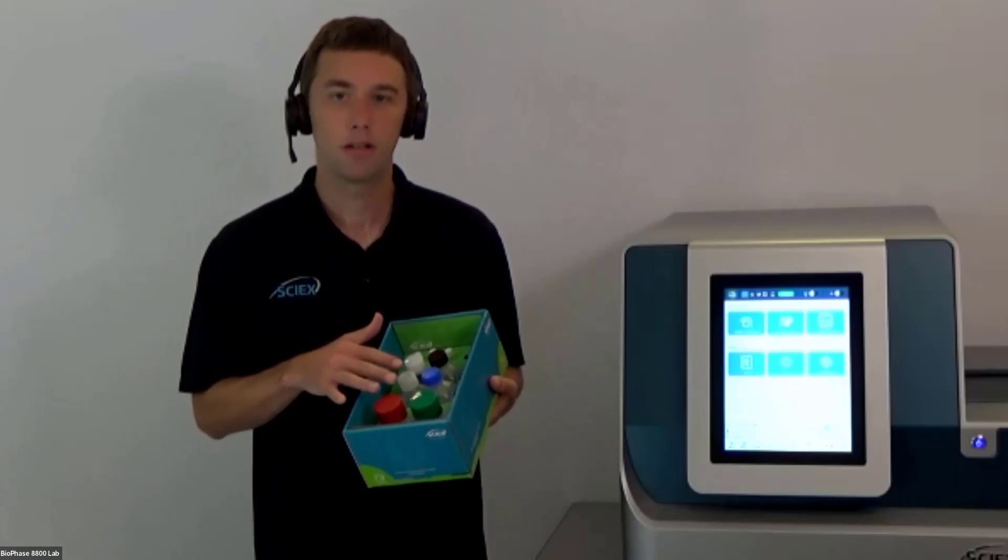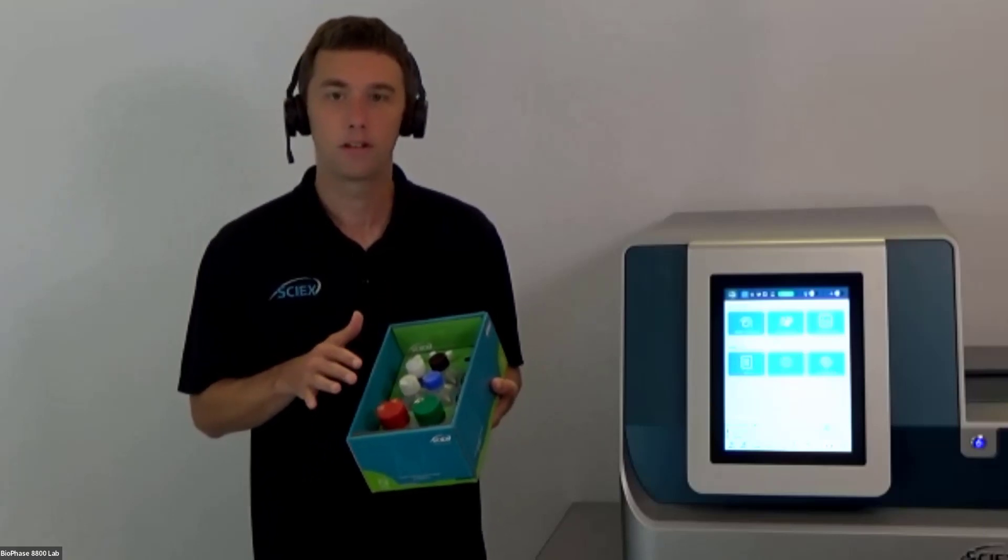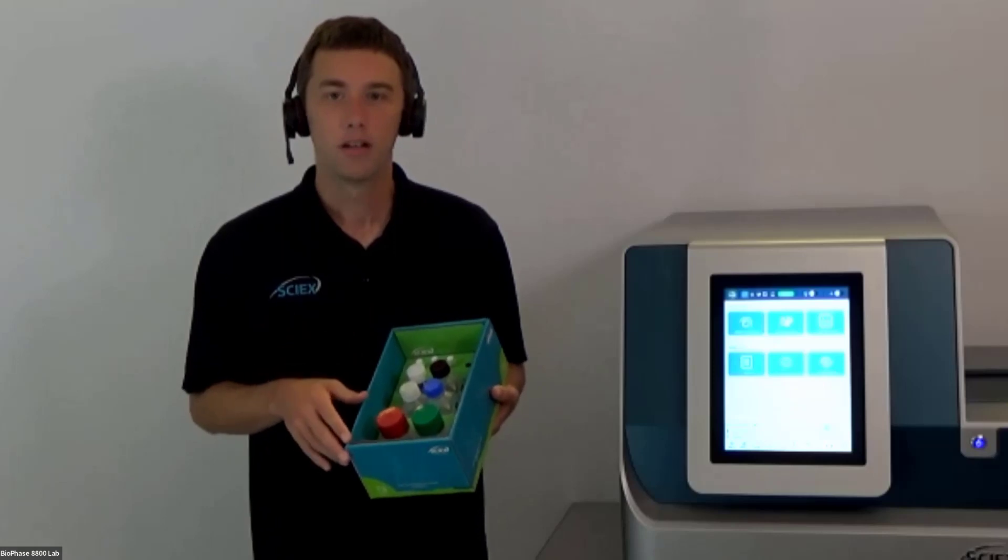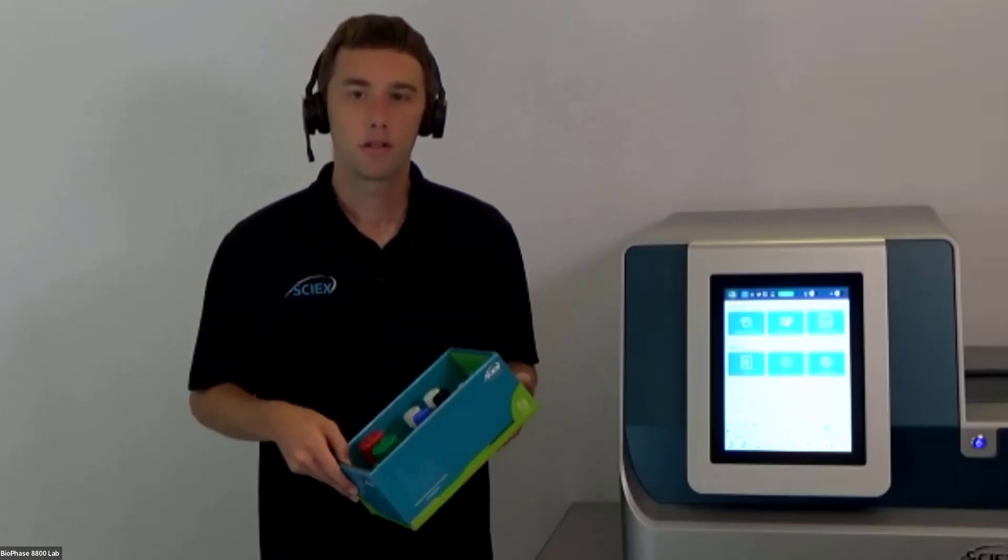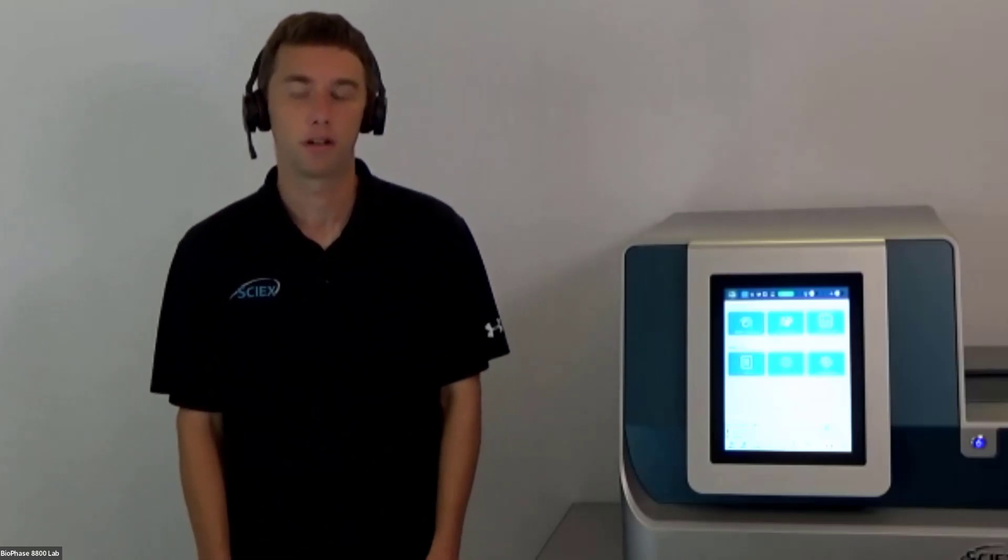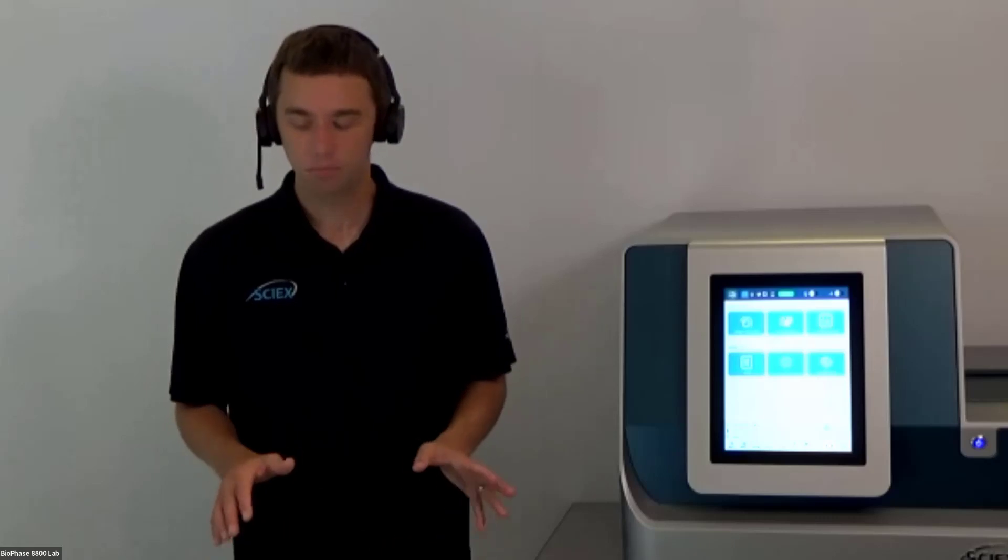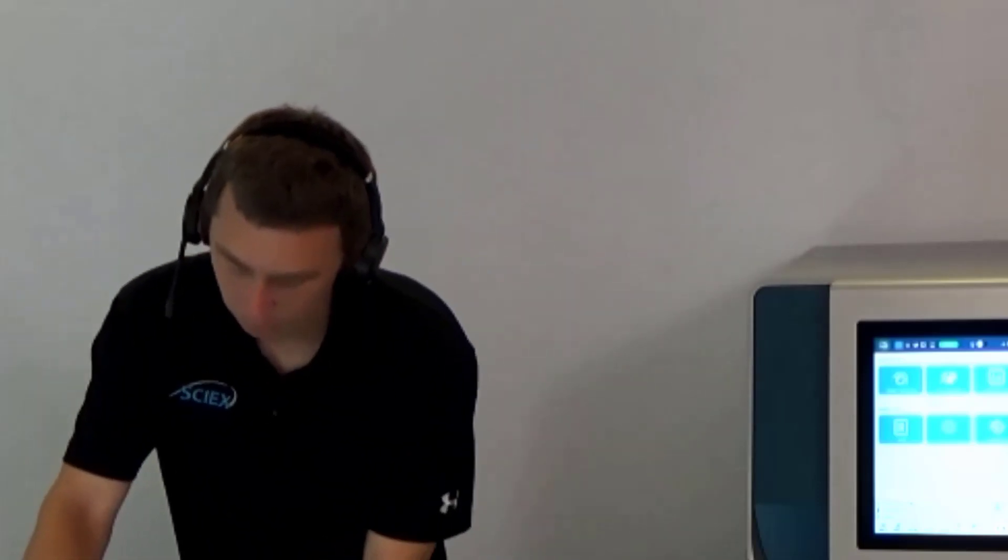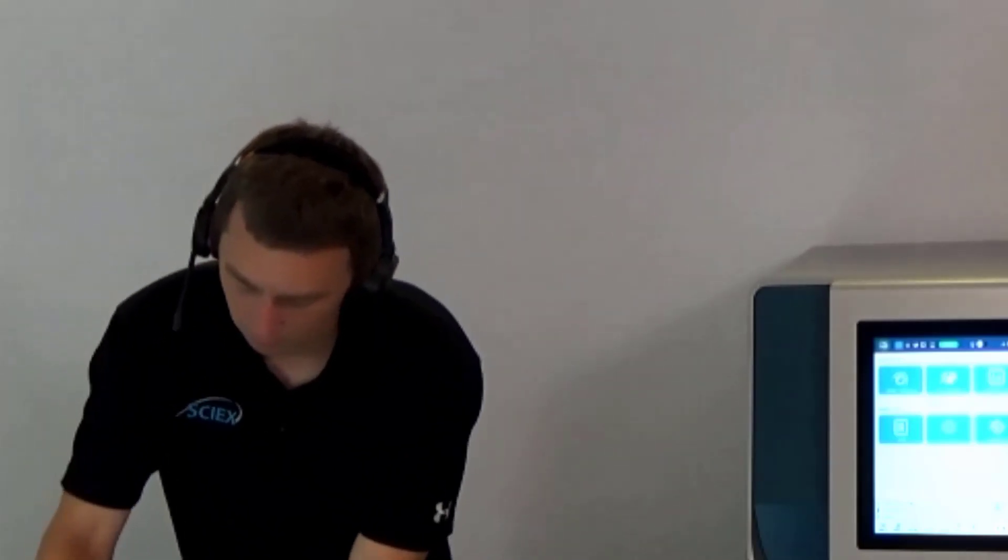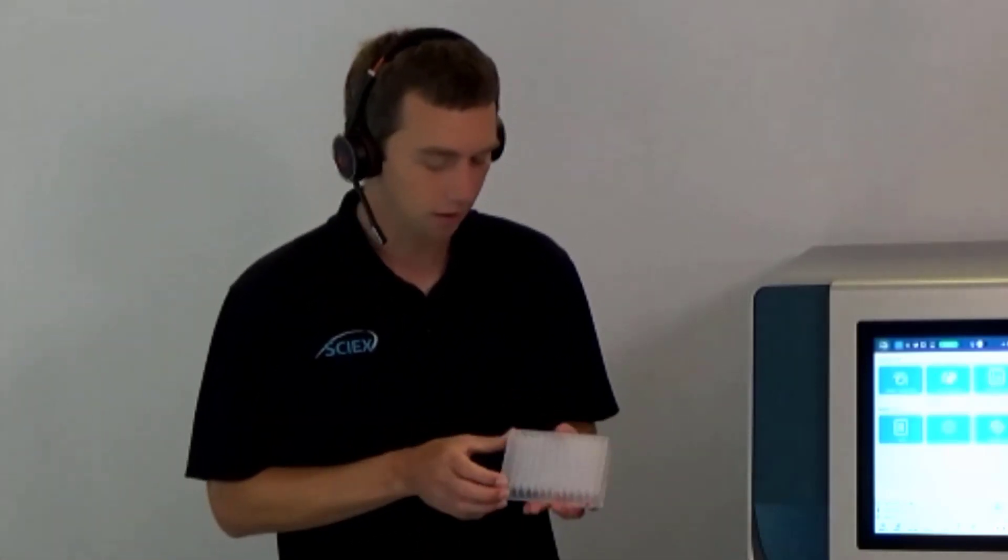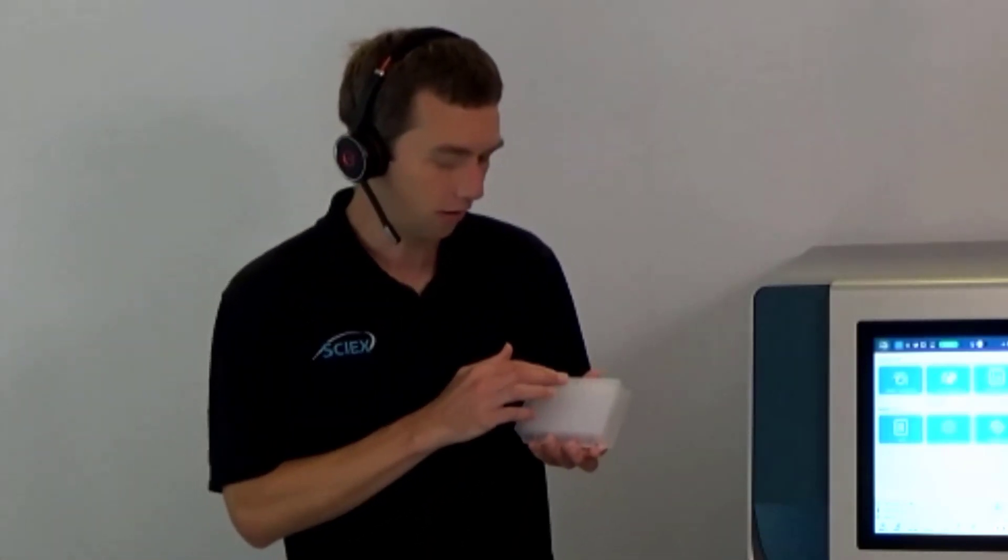We just add our PI markers, add our analyte, add our ampholyte, and we're ready to go. For those of you that have used the PA100 Plus CIEF, we are fairly familiar with this workflow. But now we're providing you all those reagents to run your sample analysis. The kit itself can process about four half plates, roughly about 200 samples. We say that because you're not always going to be running a full plate. If you don't have a full set of samples, you're not wasting all those reagents to just run half of your plate.